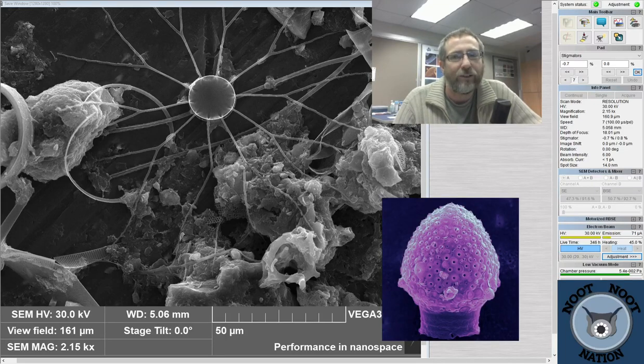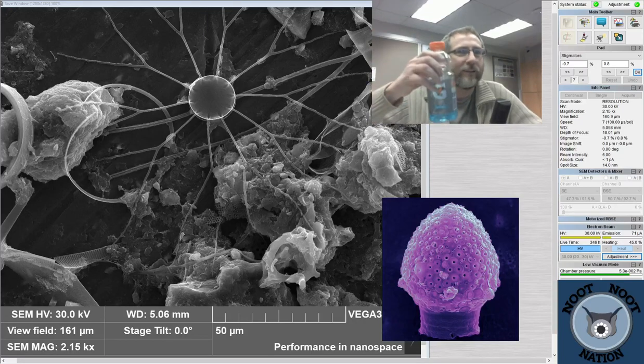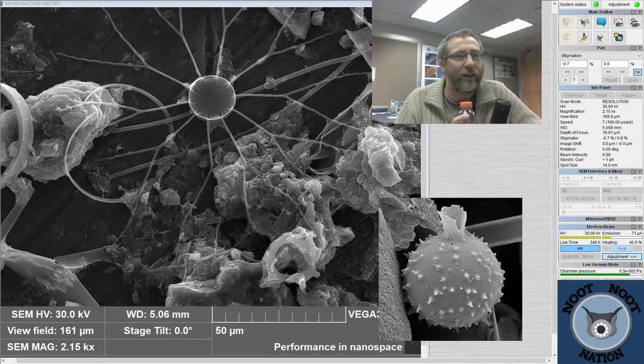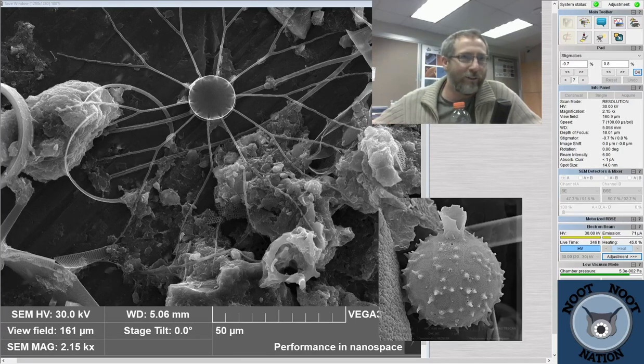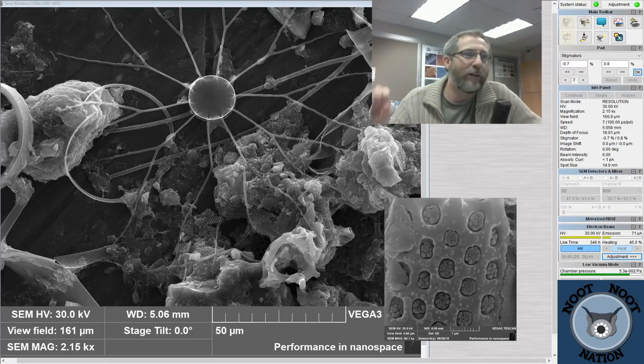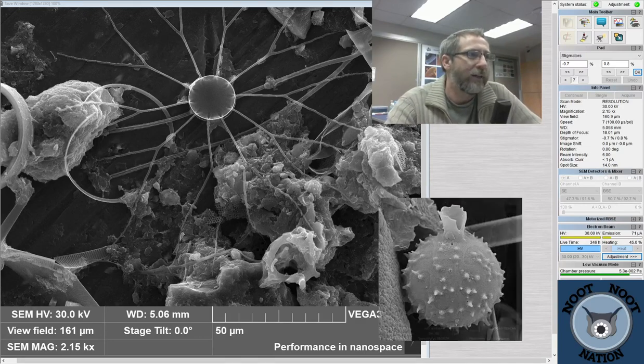If you're just collecting water, like if you just took a bottle this size, it probably wouldn't actually get that much material. You need maybe something about the size of a gallon milk jug, if you collected that much water and then just let it settle and poured all the water off the top or vacuum lined it off. I know you have a lab probably. You could send me the stuff at the very bottom of that. It would work. I suppose you could try it out.